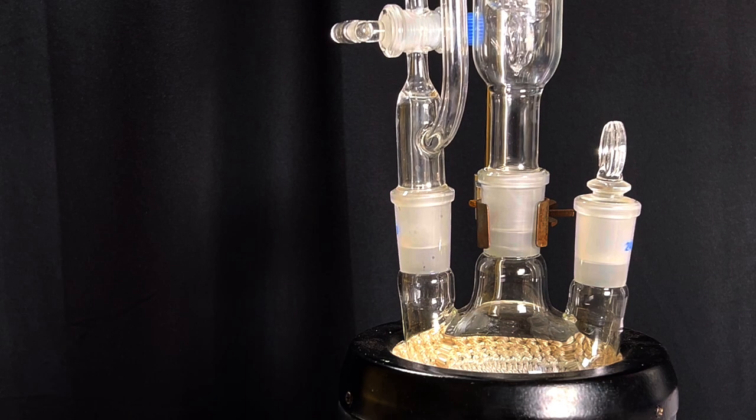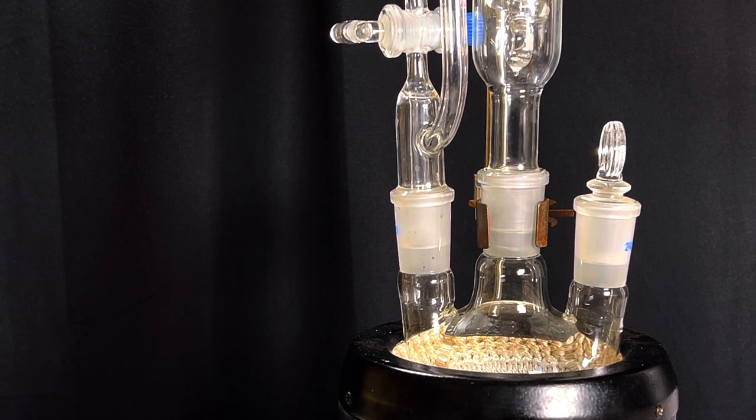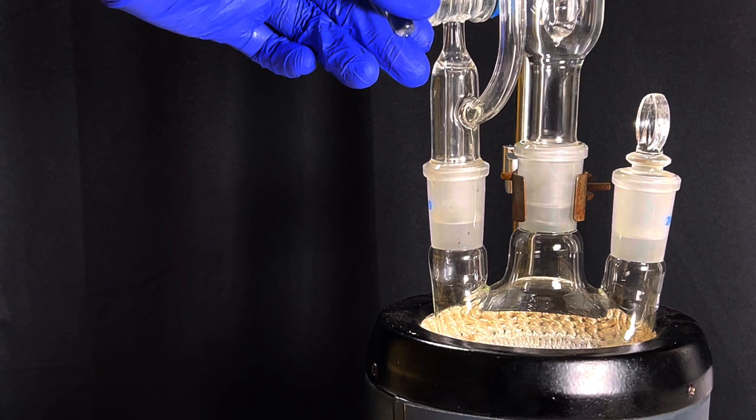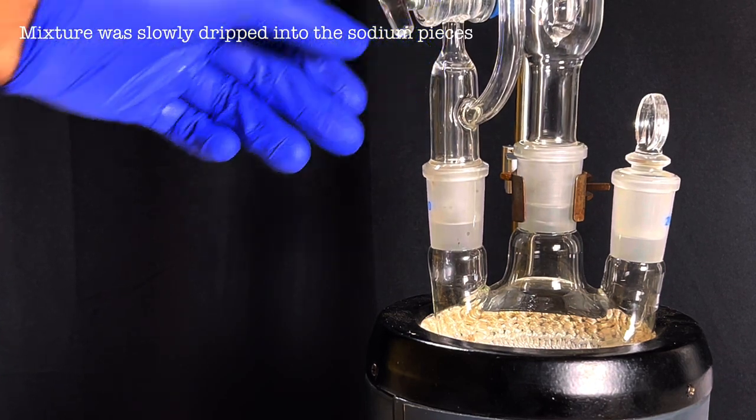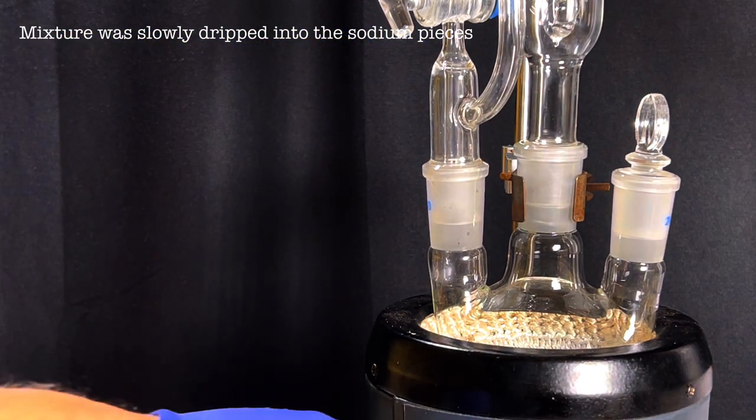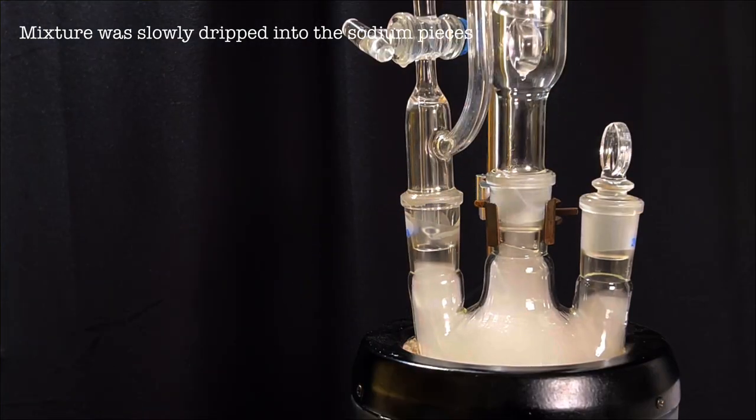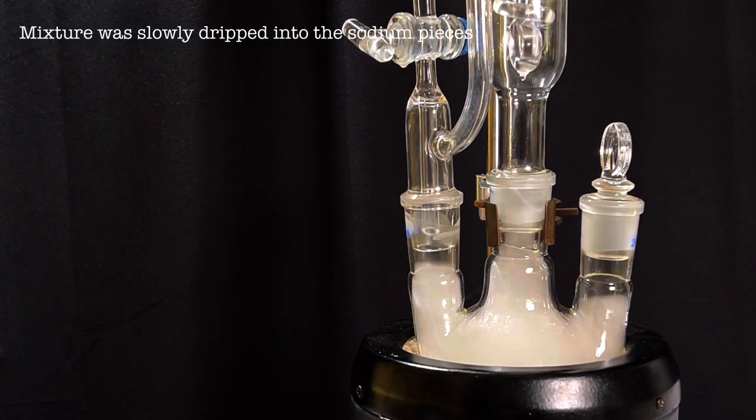Cold water was circulated in the Dimroth condenser and the knob of the addition funnel was turned to slowly drip the mixture to the sodium in the flask. Soon you will see dense white fumes in the flask and the flask starts getting very hot.